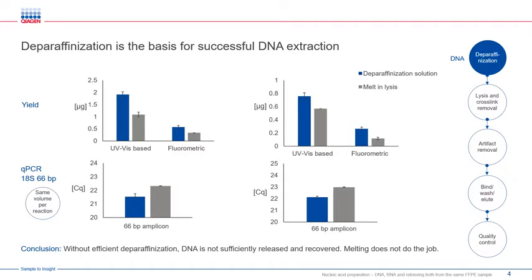I will now go through each of these important steps and provide some data to illustrate important aspects and what we consider best practice, starting with deparaffinization. There are certain protocols where deparaffinization is done by simple melting of the paraffin in lysis buffer. Here in this experiment, this is compared to deparaffinization using our deparaffinization solution.